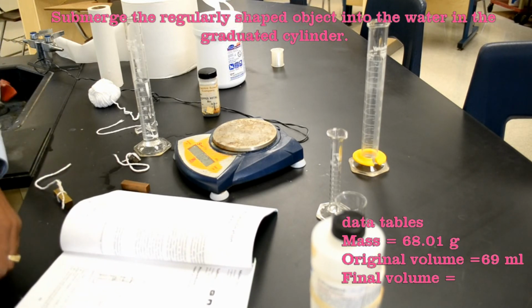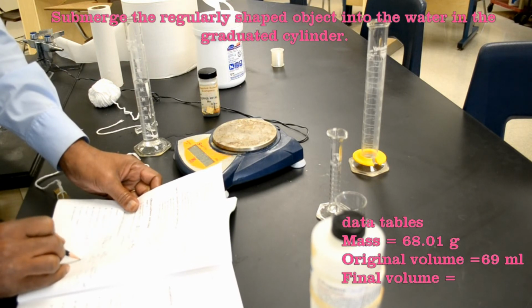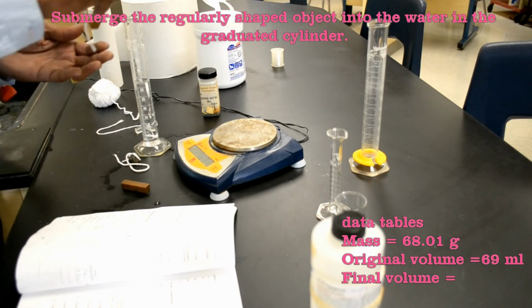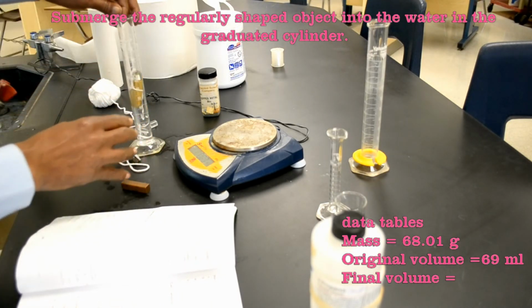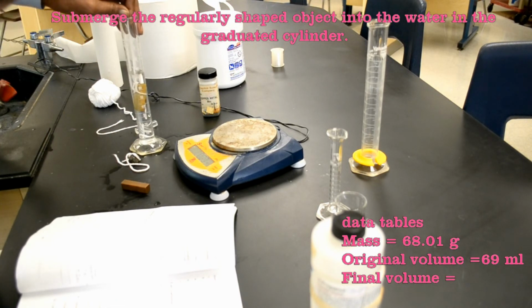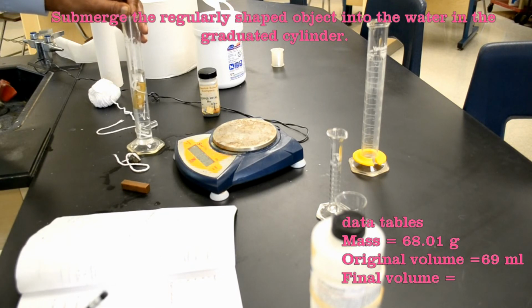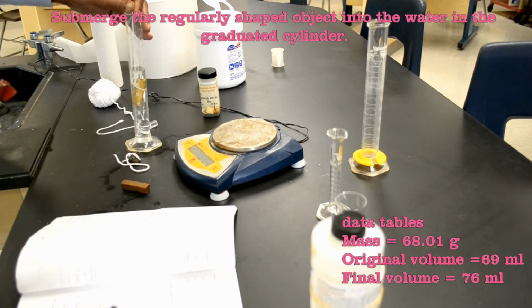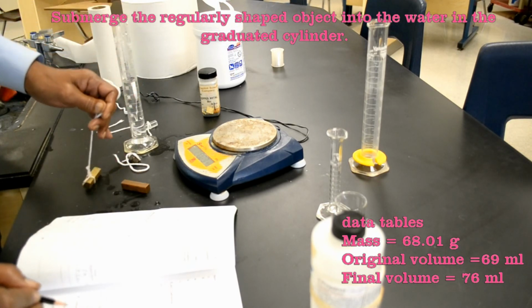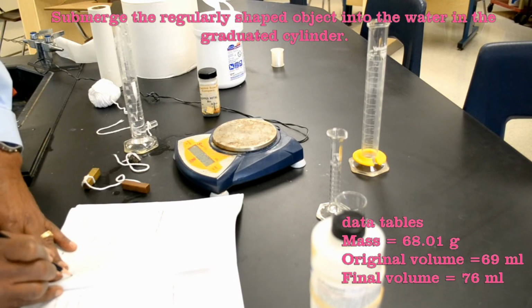Now I'm going to place this regularly shaped object into the graduated cylinder, and the volume goes up to 76 mL.